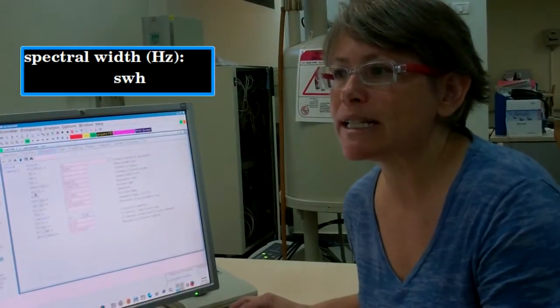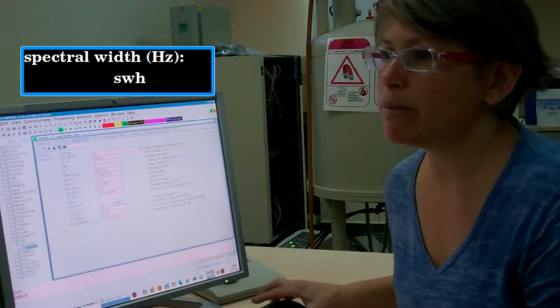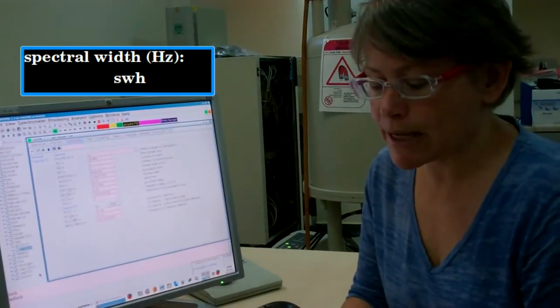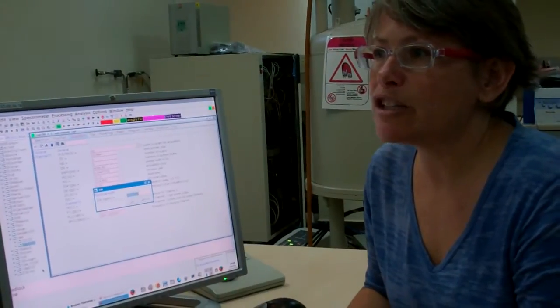The spectral width in Hertz is given by SWH. If I want to know the spectral width in PPM, I can type SW at the command line, and it will do the calculation for me.